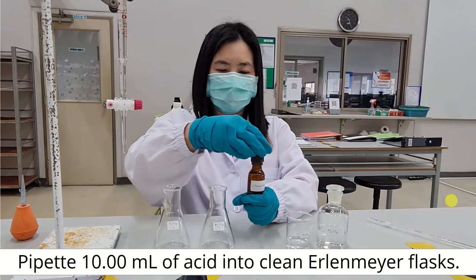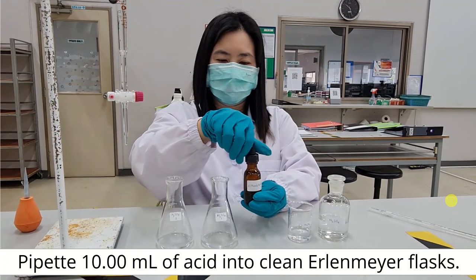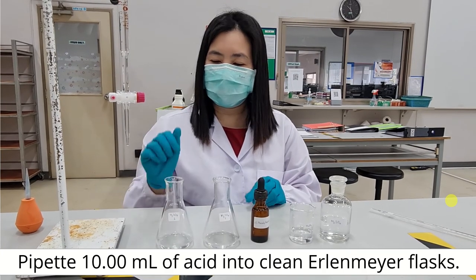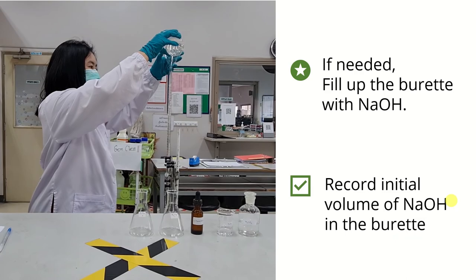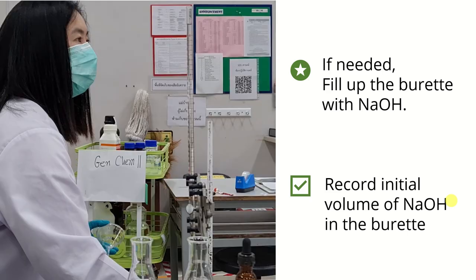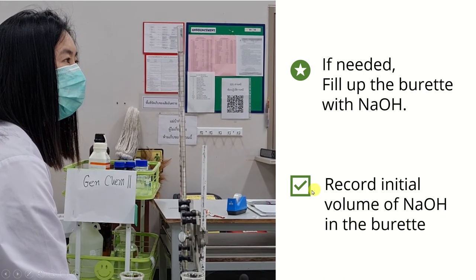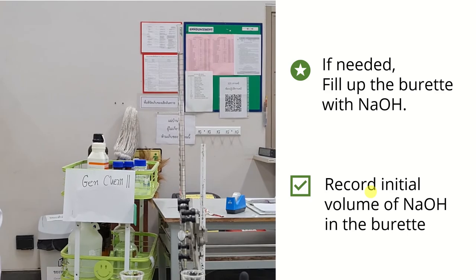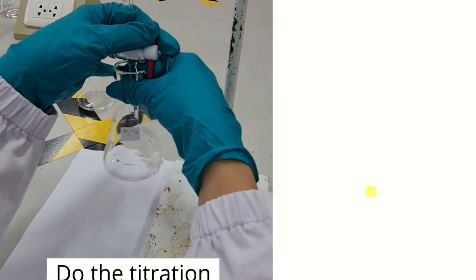Okay, do not forget to add indicator into the acid sample. Just a few drops. Then check the burette to see if you have enough titrant. If not, you may need to fill it up. And do this at eye level, adjust the level of solution in the burette to record the initial volume. Bring it back to the table and do the titration.